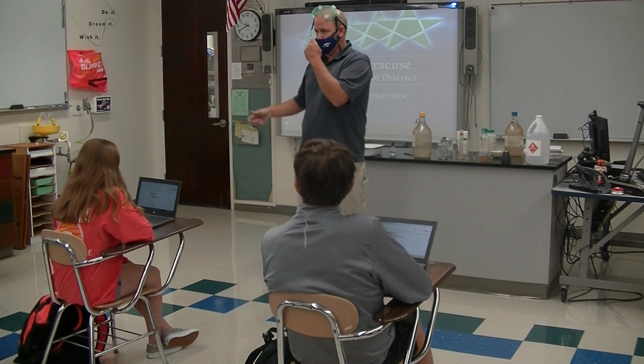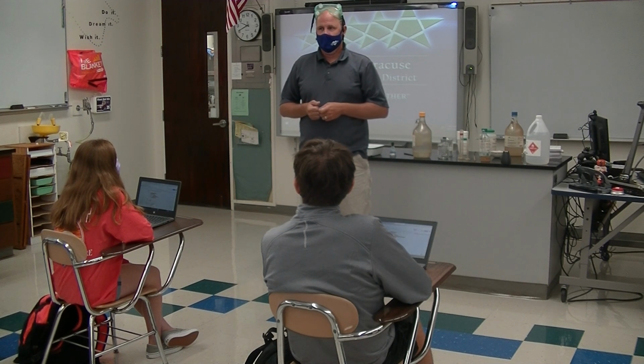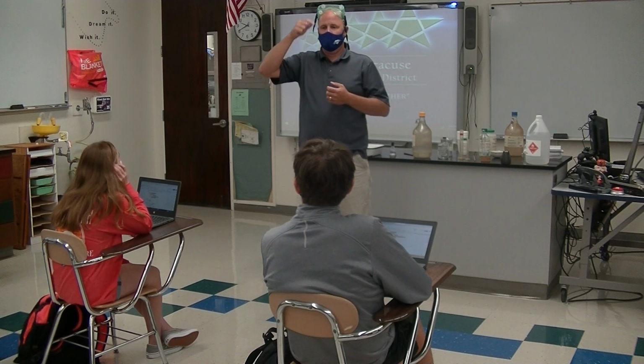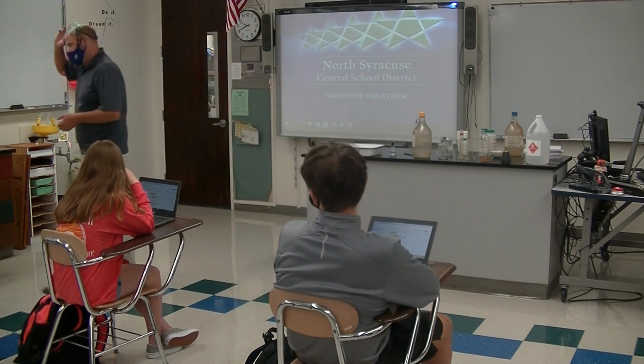That I have done with students. I have actually had to hold their head in the water, kind of peeling their eyelids open. Because as soon as the liquid gets on your eye and you close your eyelid, it goes all the way around your eyelid. If it's a chemical that's strong enough to burn it, we want to make sure that we get all of it out.